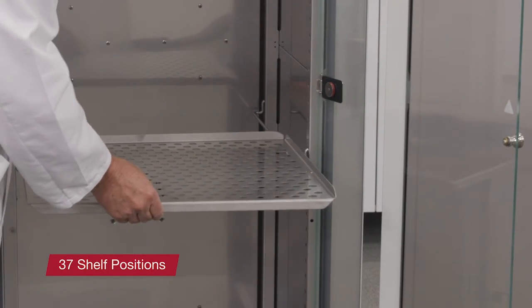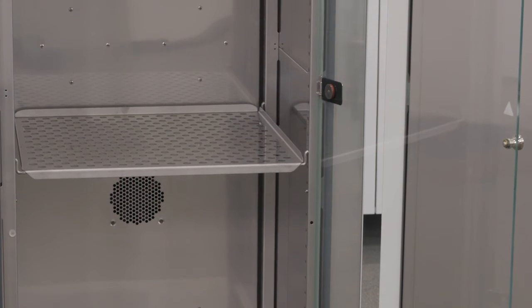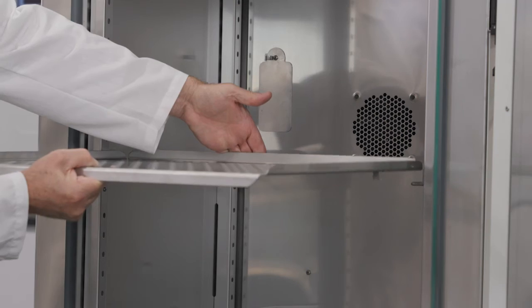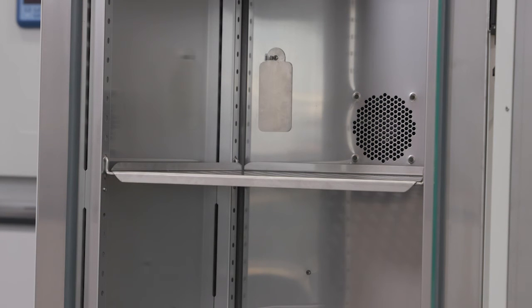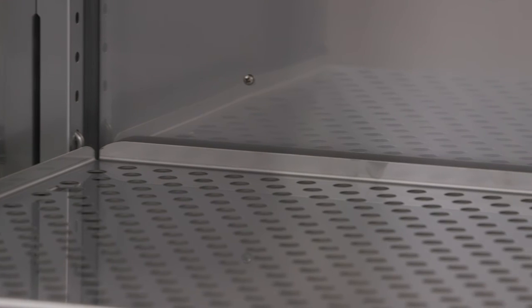The IMP400 refrigerated incubator contains 37 shelf positions for maximum flexibility. The holes on the shelf supports alternate between round and oval to help keep shelves even when inserting shelf supports. Each unit comes standard with two perforated stainless steel shelves. Additional shelves can be ordered to accommodate your application needs.